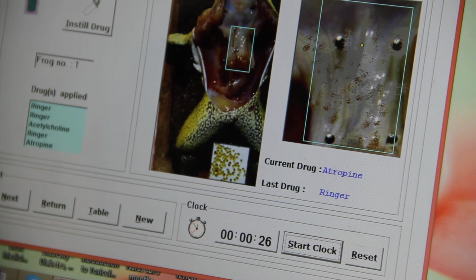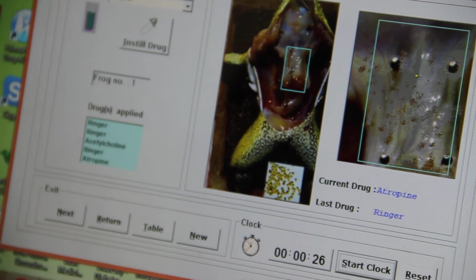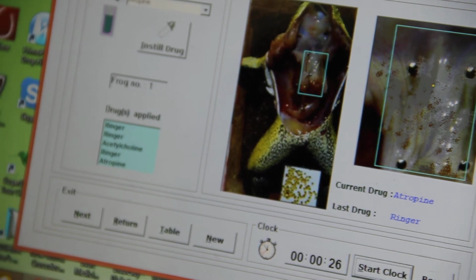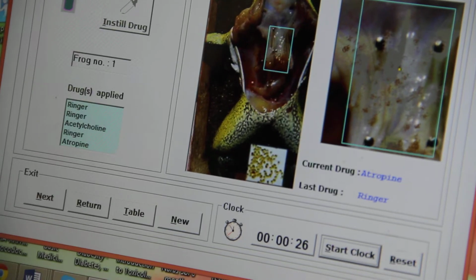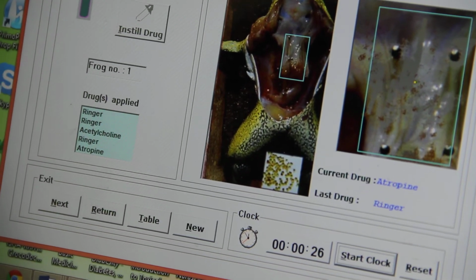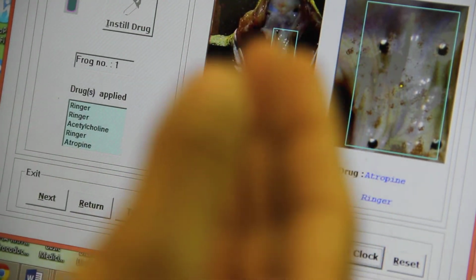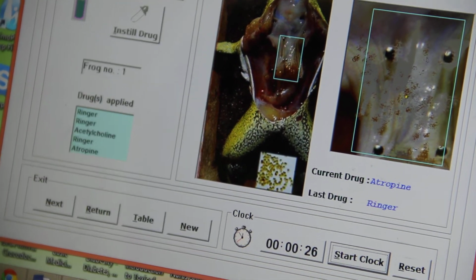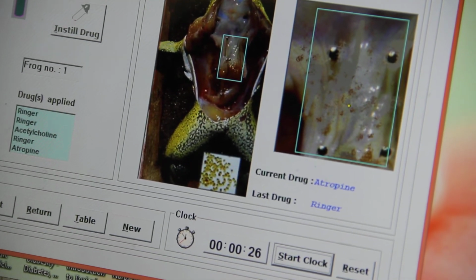In the observation you write whether acetylcholine increases motility. You know that acetylcholine increases the motility, and atropine will decrease the motility. Just simply write like that. And in the report you explain the result: why acetylcholine increased the motility, why atropine decreased the motility, what kind of receptors, muscarinic.